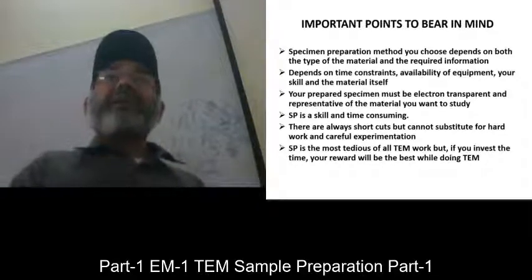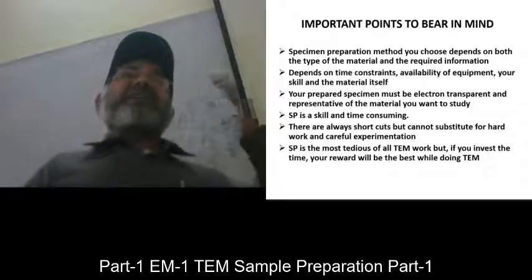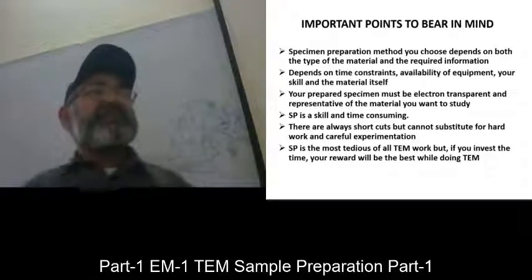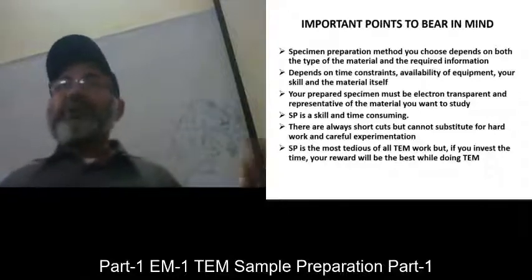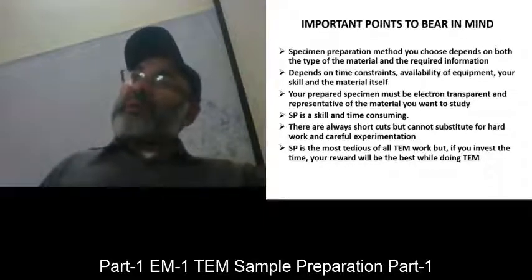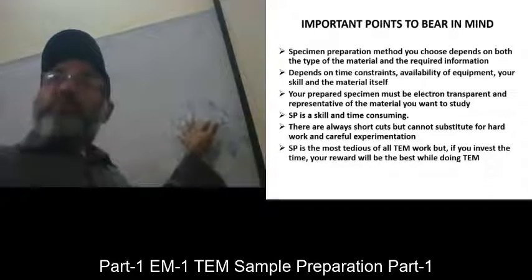And whenever you describe such results, you don't say that the EDS revealed this percentage and it matched or it is exactly that particular phase. But what you say, the safe statement, is that the approximate elemental composition detected through EDS, or measured through EDS, was close to that ratio. For example, one was 1.9 and the other was 2.1. So it is close to 1:1 ratio.